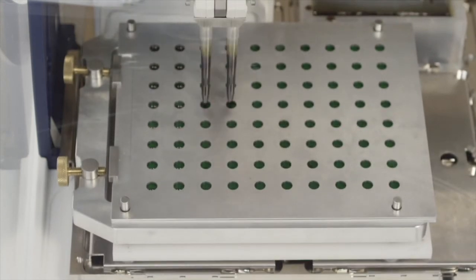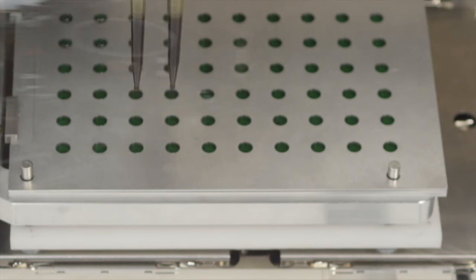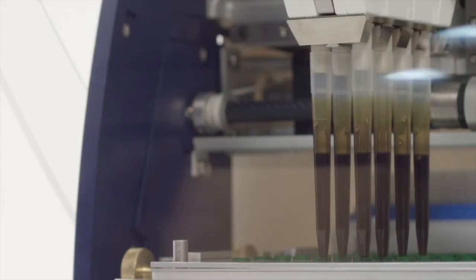The built-in safety protocols do not allow you to overfill or misdose a capsule, helping you create only the most perfect final product.